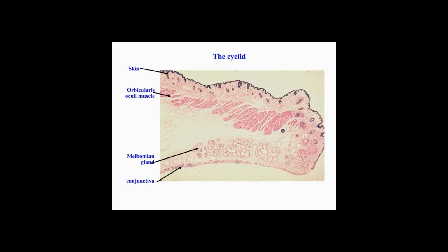This is a very nice slide for the eyelid. As you see here, we have the skin very evident, very thin, no fat, and we have small hair follicles. Of course, the hairs are falling here in this section. Here we have the acidophilic striated muscle. This is the muscle orbicularis oculi, and this is the margin showing the follicles of the lashes in 2 rows.